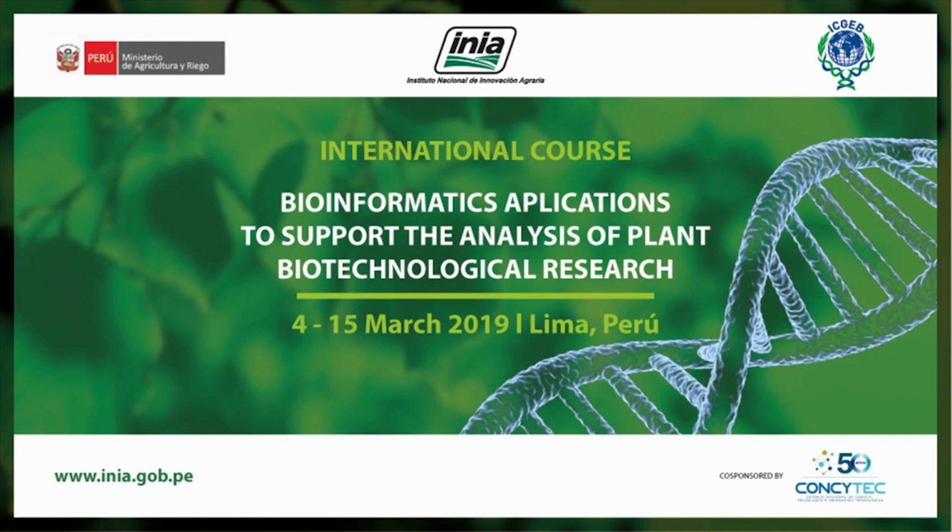Yeah, the most likely scenario is you'll have to go all the way to the original Clustal paper. It is going to give you a thorough description of what each of the parameters is, because this has a lot to do with how the algorithm works and how the statistics of the calculation are being met. It is a lot to go into. So as David was mentioning, this is exactly the same thing you did yesterday, just using a different tool.